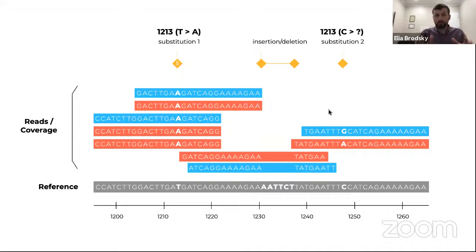Okay, so important terminology here, haplotypes. When we say a new virus, we need to define if we're looking at different levels of taxonomy: species, family, phylum, etc. We'll talk about all of these concepts. But right now, what I wanted to mention is just where the data is coming from and what type of information we are getting out of this data. In this particular example, we are seeing a change, a substitution, based on alignment to a reference.